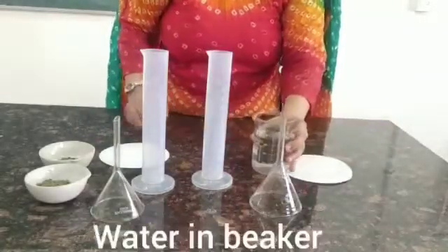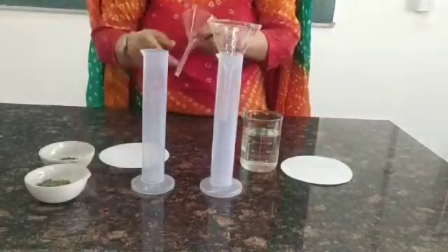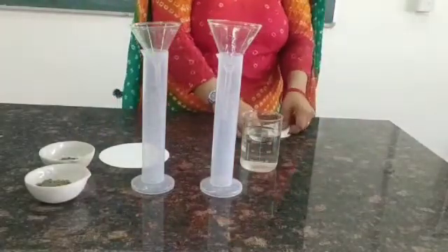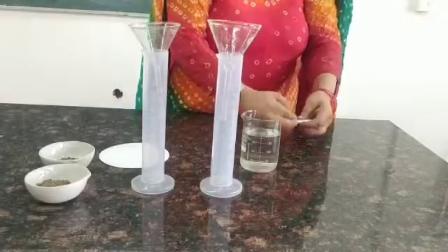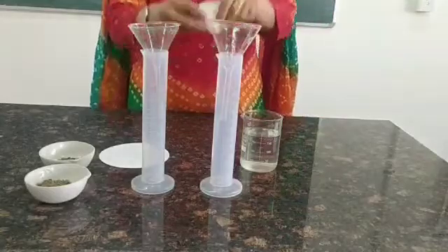First, we are going to place the funnel inside the measuring cylinder. We'll fold the filter paper and put it inside the funnel. We'll place the other filter paper in the other funnel.